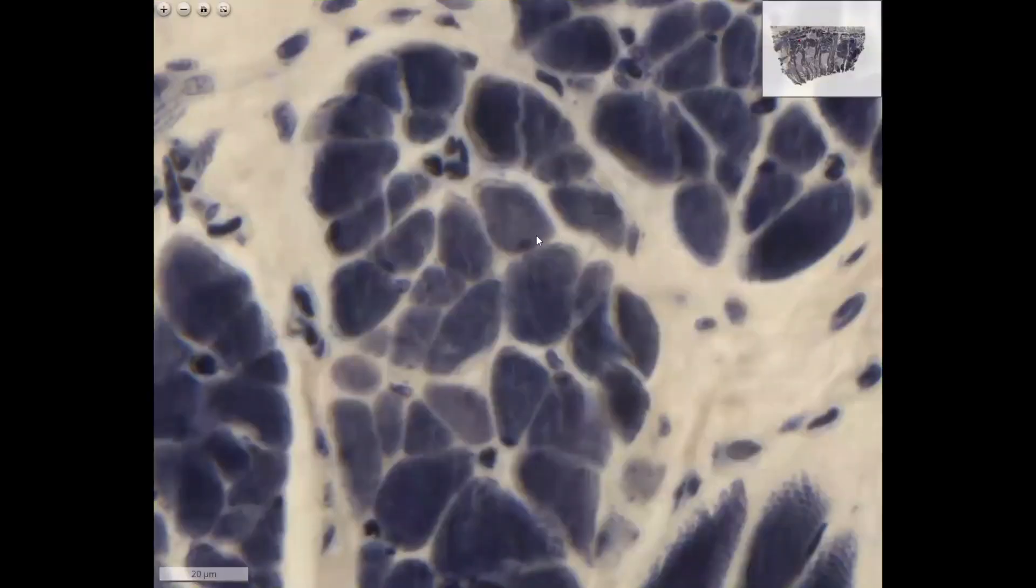In the cross-section profiles, the nuclei are also under the sarcolemma, like here. Or you don't see a nucleus because the cut didn't go through the plane of the nucleus. You see a fine punctuation in the cross-section of these muscle cells. These are the cross-sections of the myofibrils.